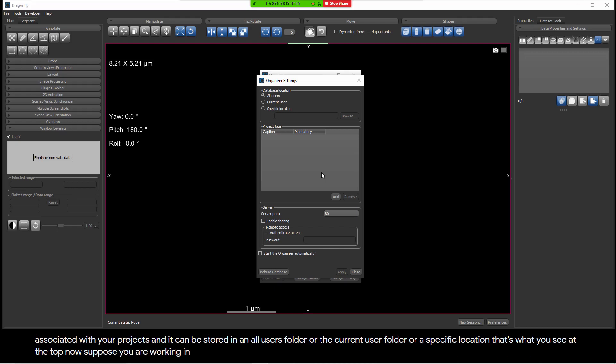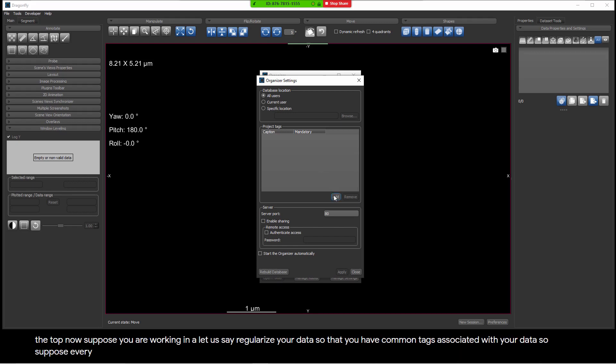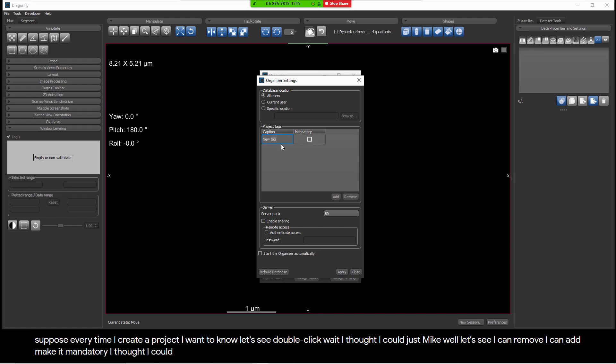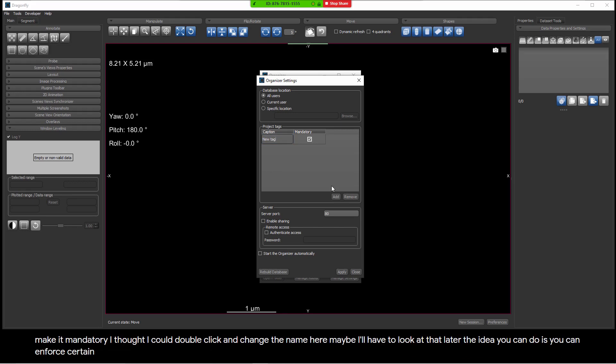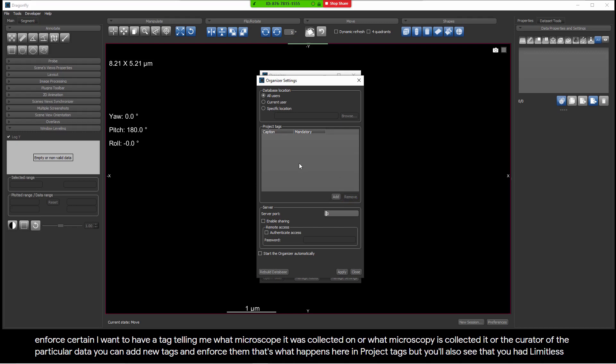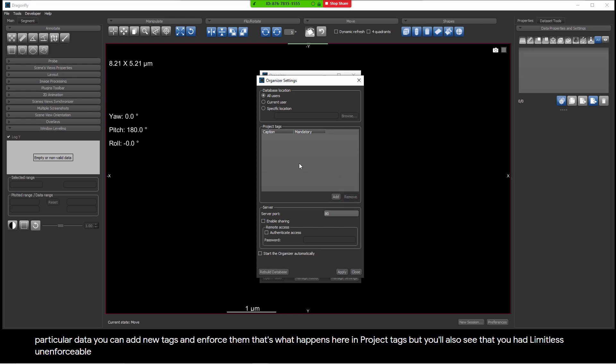Suppose you are working in a work environment, and you want to regularize your data so that you have common tags associated with your data. Suppose every time I create a project, I want to know, let's see... The idea you can do is you can enforce certain tags. So suppose every time I create a project, I want to have a tag telling me what microscope it was collected on, or what microscopist collected it, or the curator of the particular data. You can add new tags and enforce them. That's what happens here in project tags. But you'll also see that you have limitless, unenforceable tags. You can have as many tags on a project as you want.